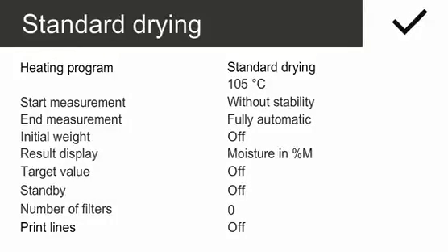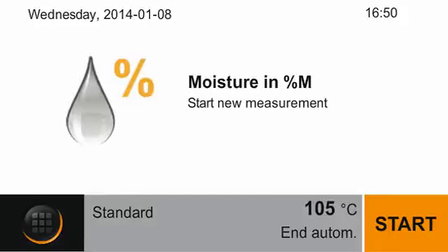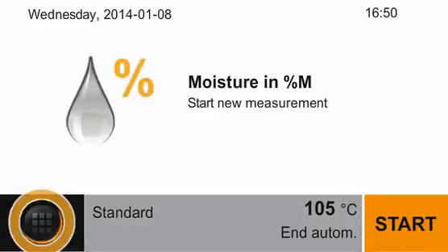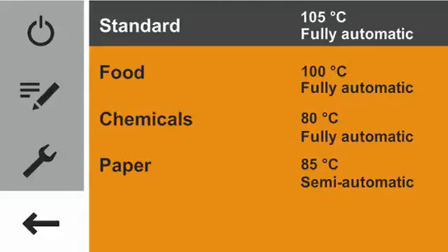Close this view by tapping on the hook button. Please tap on the main menu button. In this view, methods already released are displayed, sorted by their last use. You have the option to select one of the existing methods or to start the development of your own.